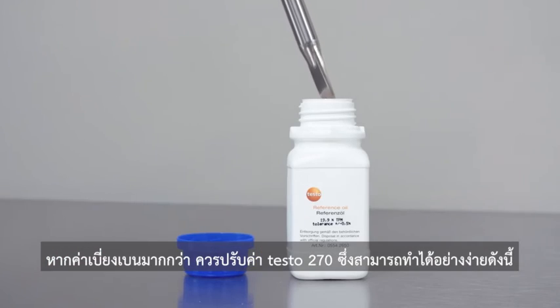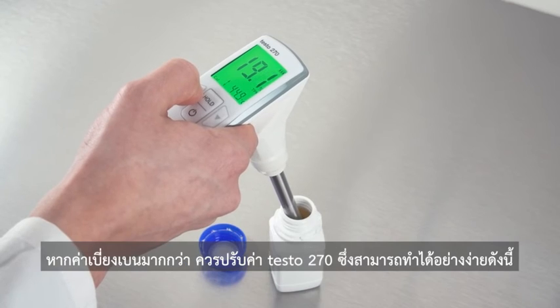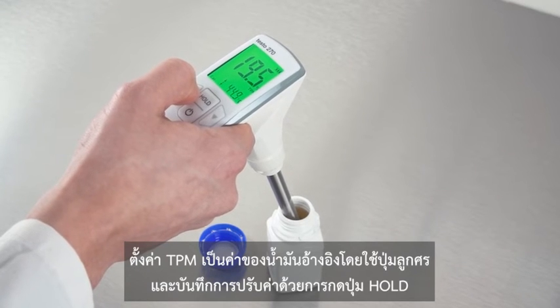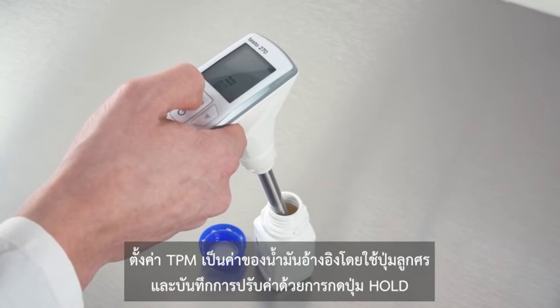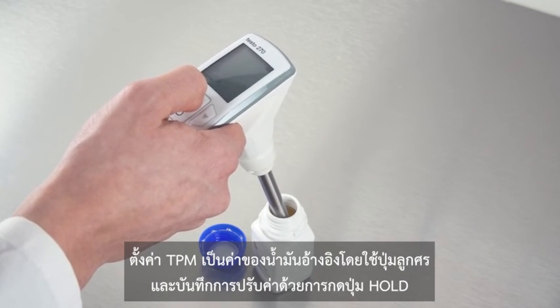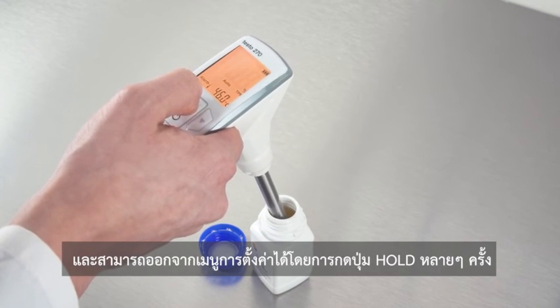If the deviation is greater, you should adjust your testo 270 — you can easily do this yourself. Set the TPM value to the value of the reference oil using the arrow keys and save the adjustment with hold. You can exit the settings menu by pressing the hold key several times.